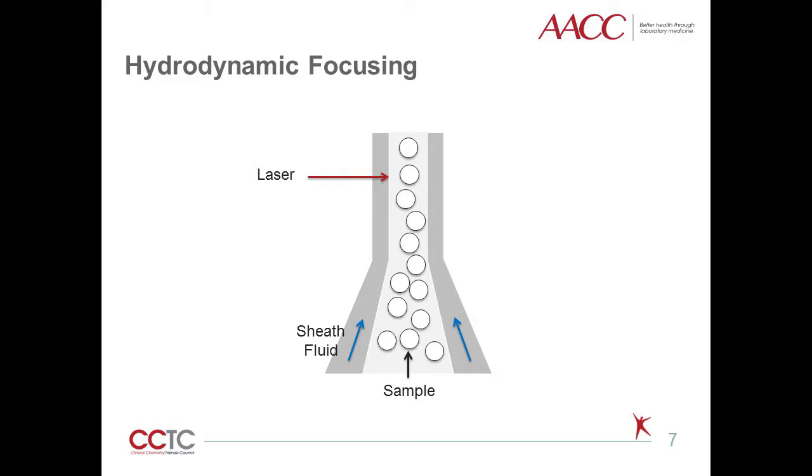This figure shows an example of hydrodynamic focusing. The sample is injected into pressurized sheath fluid, with the sample pressure being greater than that of the sheath fluid. Laminar flow keeps the sample separate from the sheath and centered in the middle of the stream.